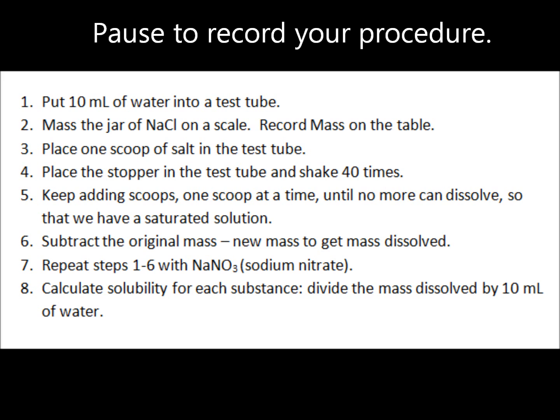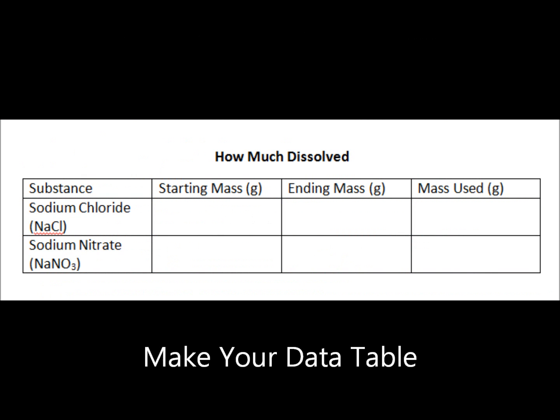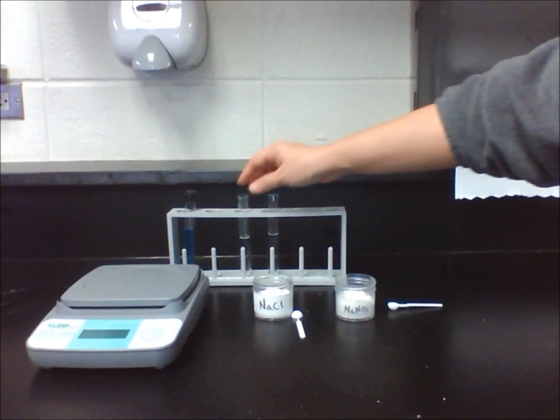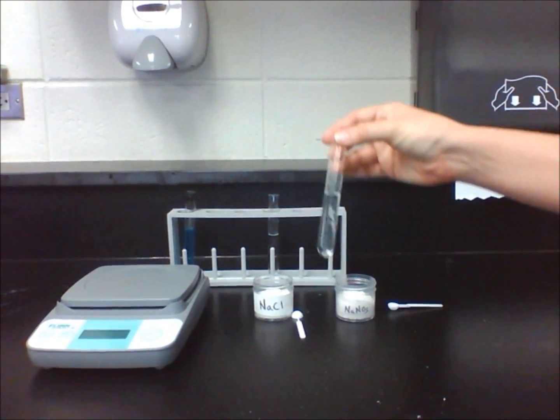Let's first put 10 mL of water into a test tube. Mass the jar of sodium chloride on a scale and record the mass on the table. Place one scoop of salt in the test tube. Place the stopper in the test tube and shake 40 times.